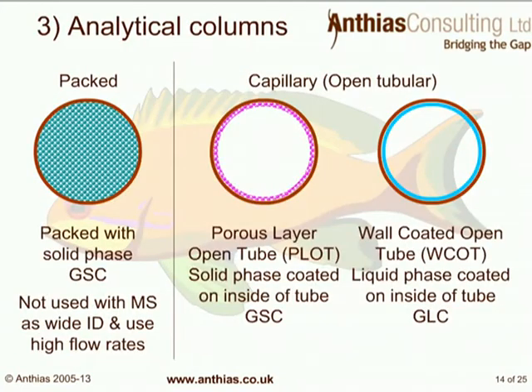So we've talked about sample introduction. Let's move on to the analytical columns themselves. There's three main types of analytical columns. These are packed columns, PLOT columns, and the most common capillary column is a wall-coated open tubular column.